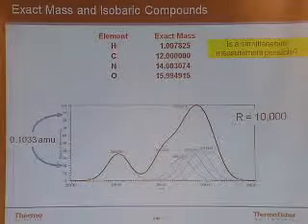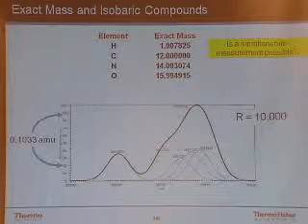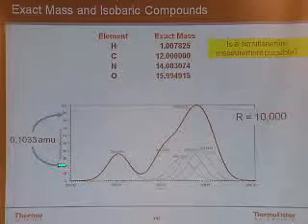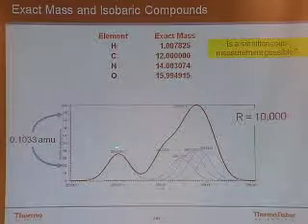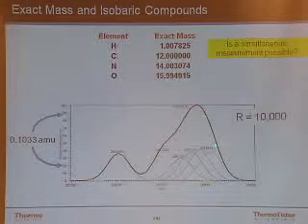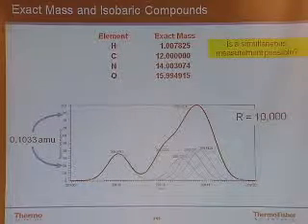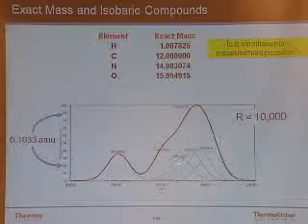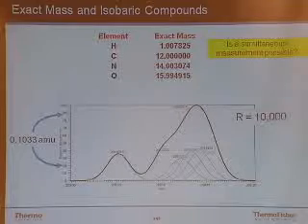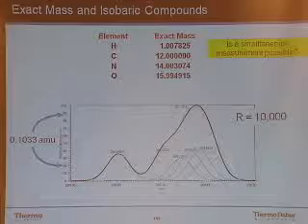Okay, and I run this in a typical mass spectrometer, like a time of flight mass spectrometer. I'll run at about 10,000 resolution. And what you see here, follow the black line, I've got one peak here, and I've got a shoulder here, and I've got another peak here. But in fact, I really don't know what I've got because there's a whole lot of co-eluting, if you will, pesticides because they all have the same nominal mass. That's why they're all going to appear about the same mass range. Okay? So that won't give me a lot of information.